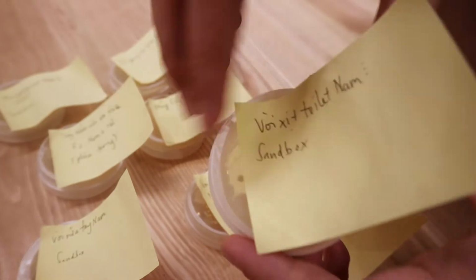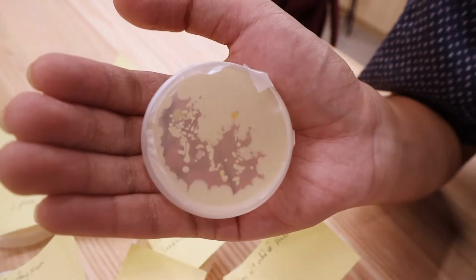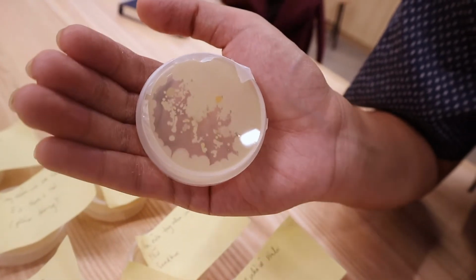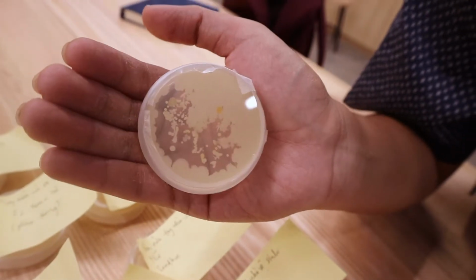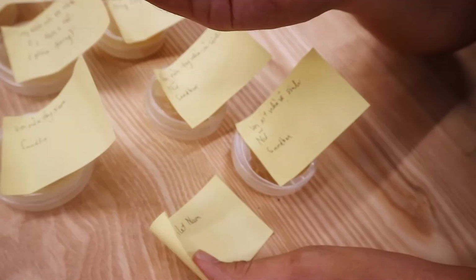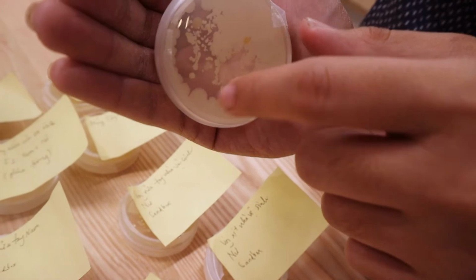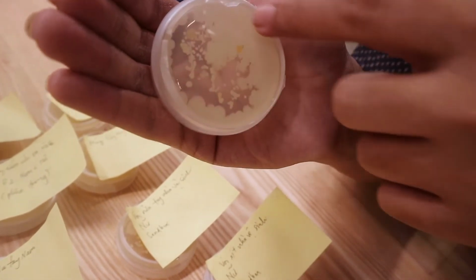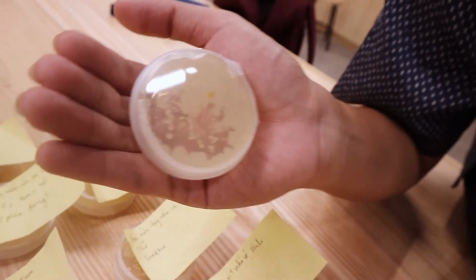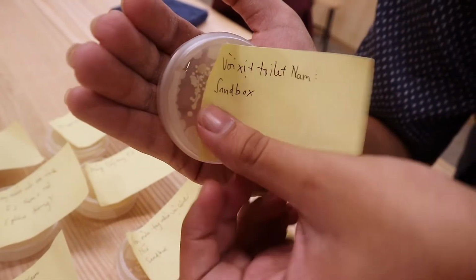Yeah, let's see, bum gun here. Strange, because from what I see, it seems like the yellow thing is more dominant, more prevalent in the girls' bathroom. Well, what is it? Do the shits of the 2 genders differentiate? I don't know. Look at this. Yeah, very few yellow spots, but a lot of E. coli surrounding this. Wow, it's as bad, but it seems to me it's less dangerous.